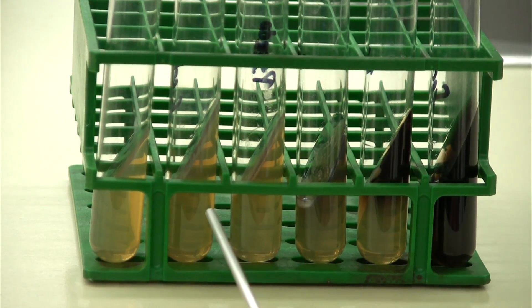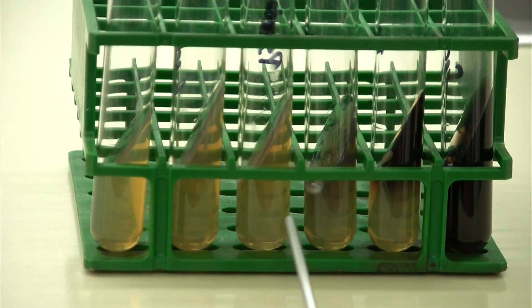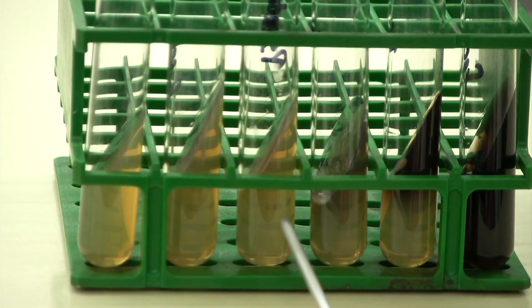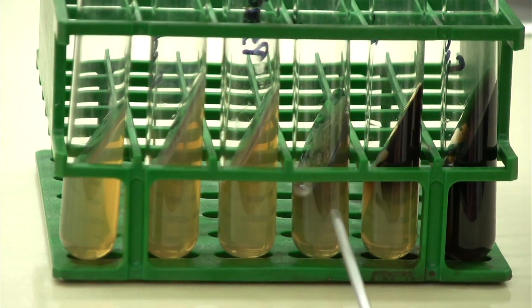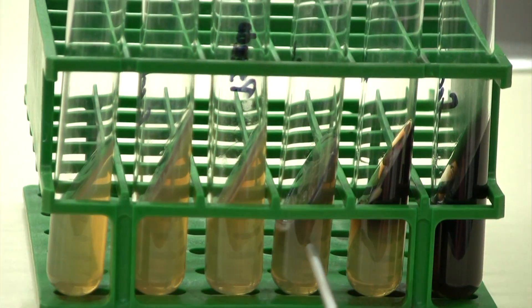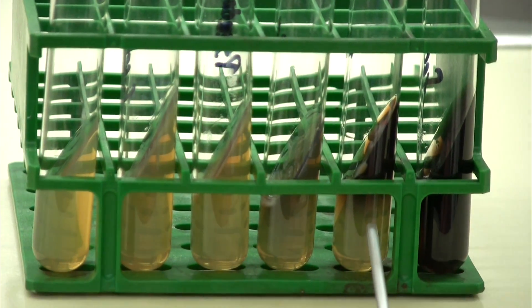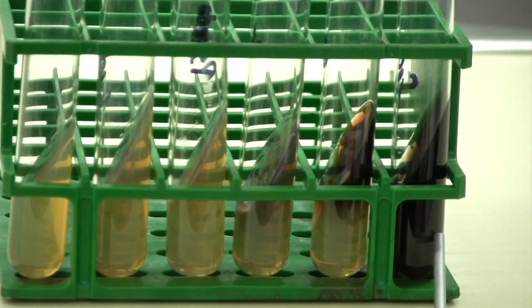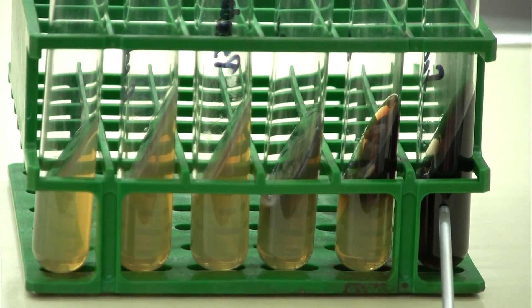In this case we have no blackening, and in this case we have no blackening. Here we have slight blackening, and in this one a little bit more, and in this one there is lots of blackening.